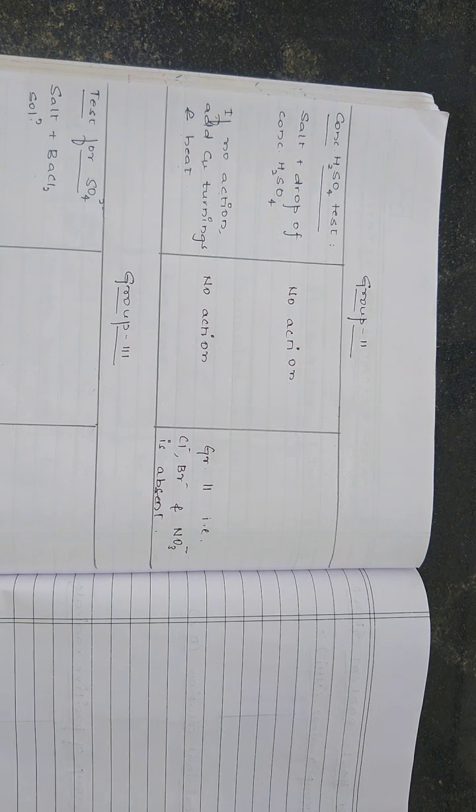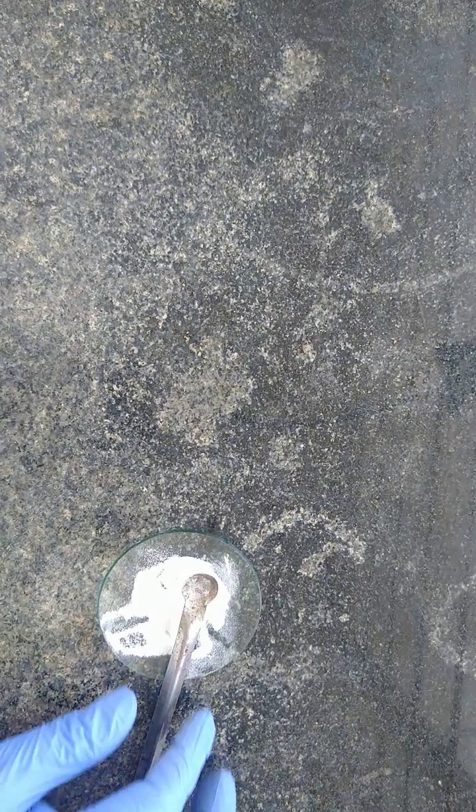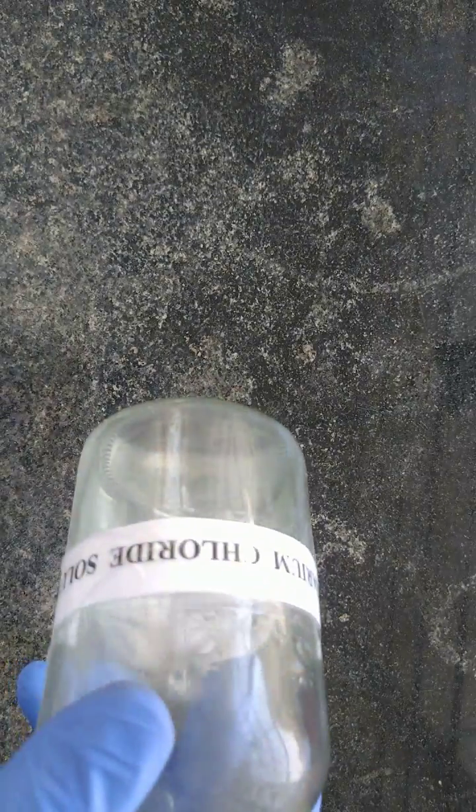Because group 2 is absent, we will go for the next group, that is group 3. So we are going for group 3, that is the test for sulfate, and we are going to perform the test by taking a small quantity of salt in a given test tube, and to that we are going to add barium chloride solution.